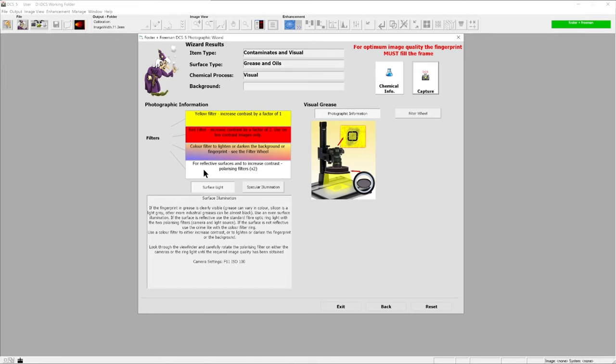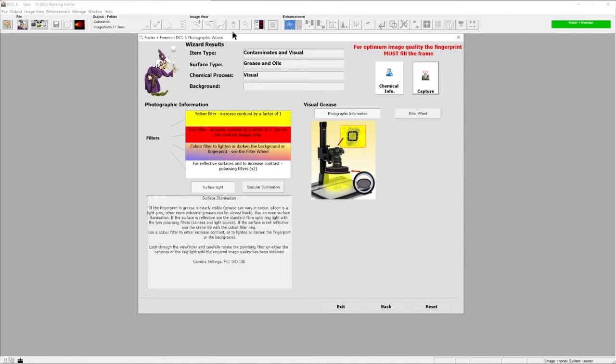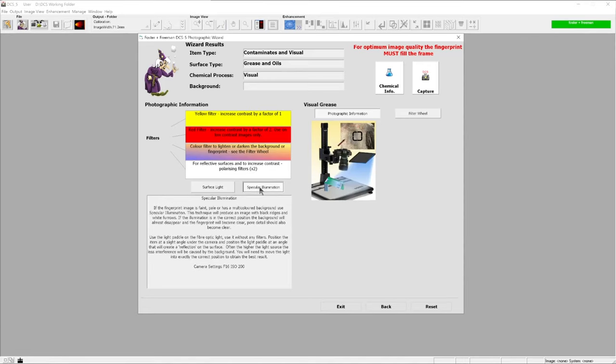In this case, we can see that we have a couple of different options. One of them being surface light - illumination from above and potentially the use of a polarizing filter.